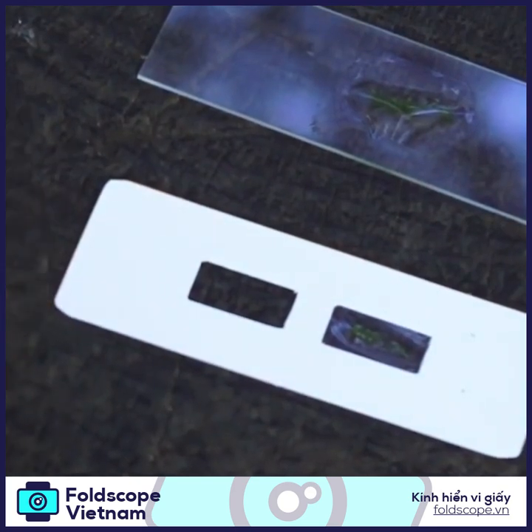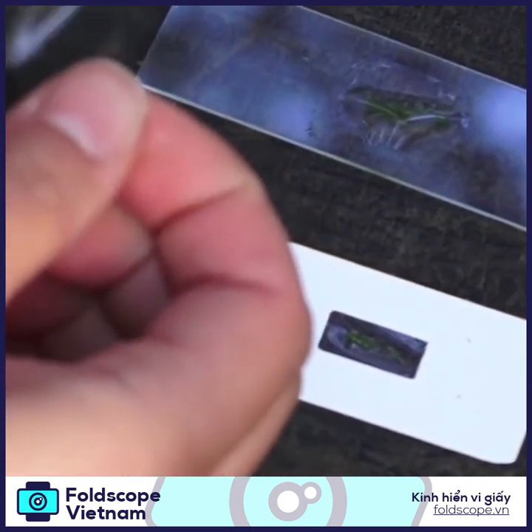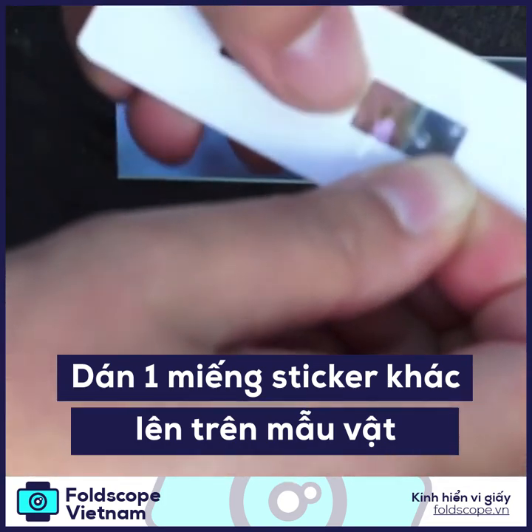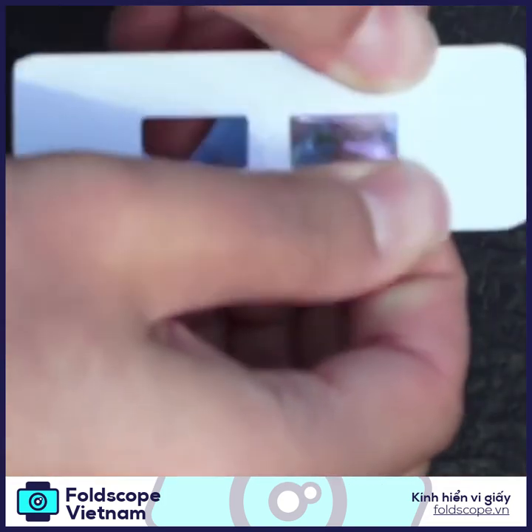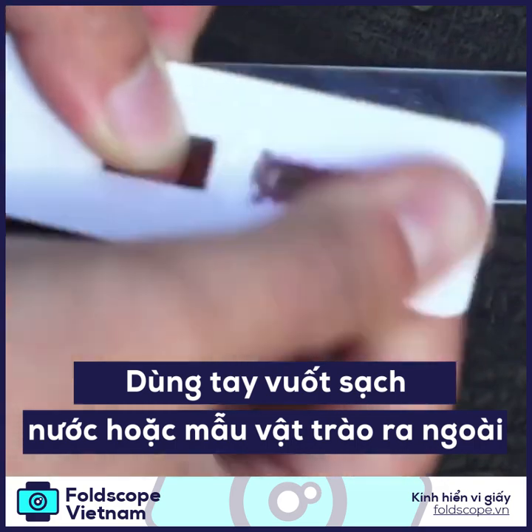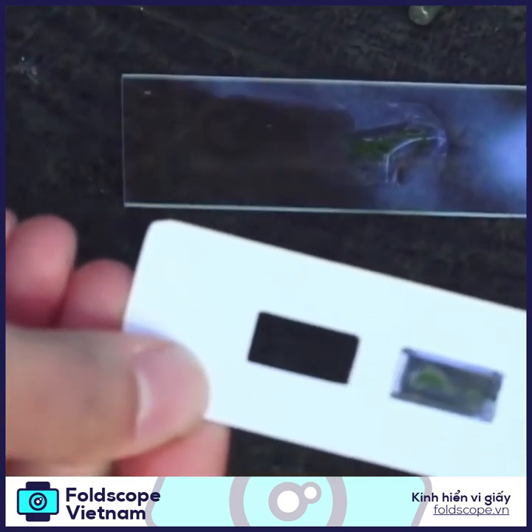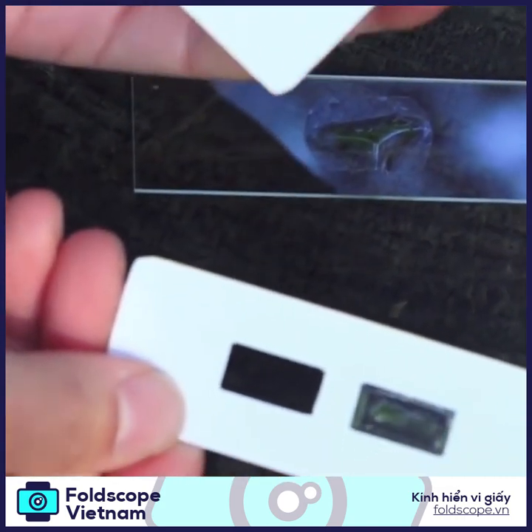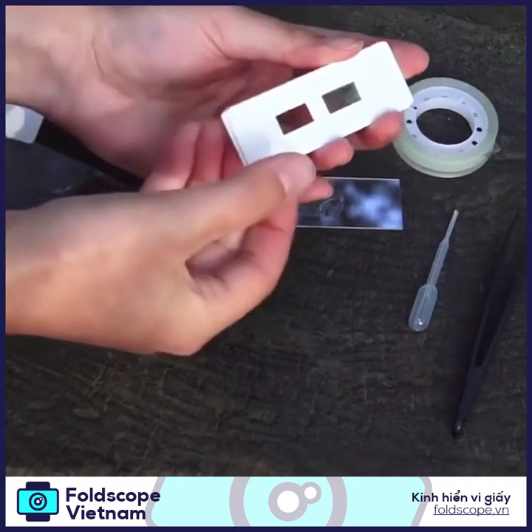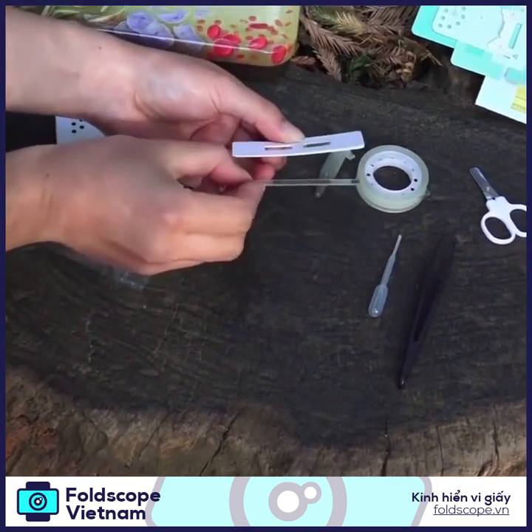Then put another sticker over so that you're sandwiching your specimen with these stickers. It's okay if something spills out — you can wipe it away. If you're using paper slides, make sure that you put two blank paper slides underneath so that the thickness is just like the glass slide.